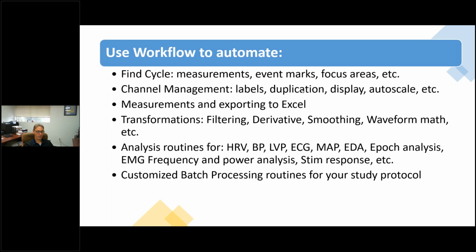And then the advantage of creating the workflow, the example I just gave you was based on one file. You can extrapolate that out so that you can run over several files. So you could do 5 files back to back, and you'll have your preparation in terms of filtering or any other conditioning you're doing.